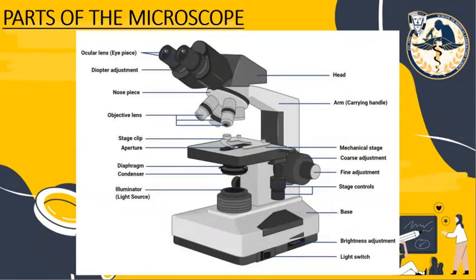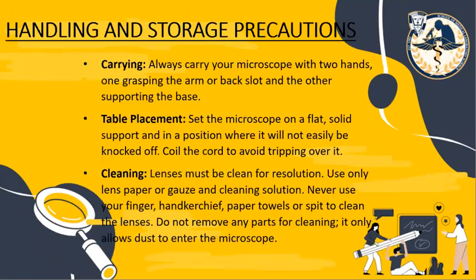For proper handling of the microscope: when carrying it, we need to use both hands — the right hand to hold the arm and the left hand to hold the base — in order to safely transfer it from one place to another. For table placement, make sure the table is stable, the surface is flat and solid, to avoid accidents and prevent the microscope from falling.